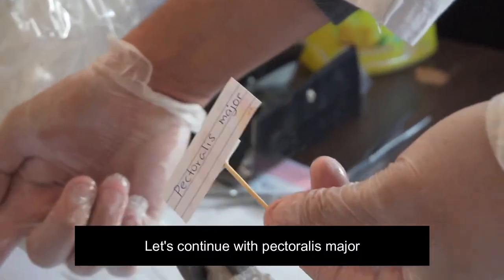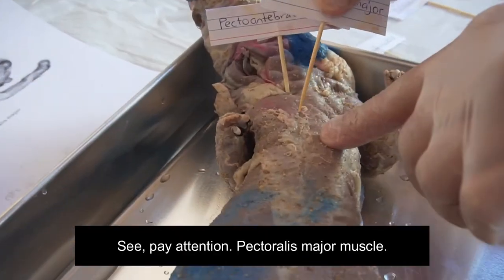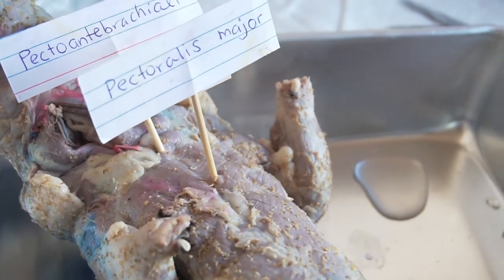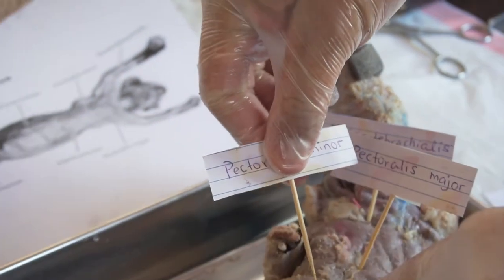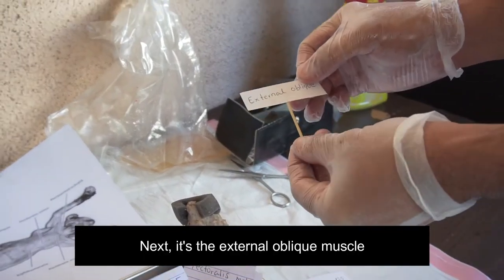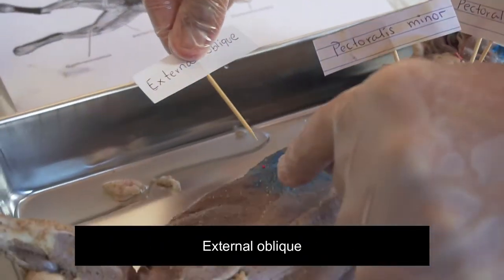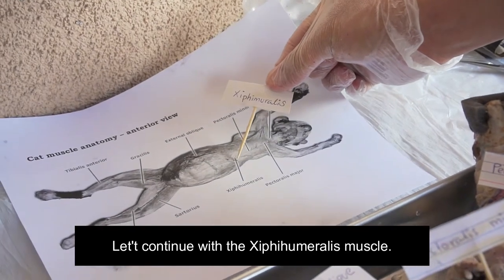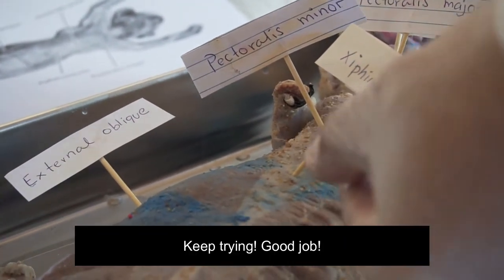Let's continue with pectoralis major. Next is identification of the pectoralis minor muscle, so let's place the label on the pectoralis minor. Next is the external oblique muscle — let's place it on the right muscle. Let's continue with the xiphihumeralis muscle. Keep trying. Good job. You are doing a nice job.